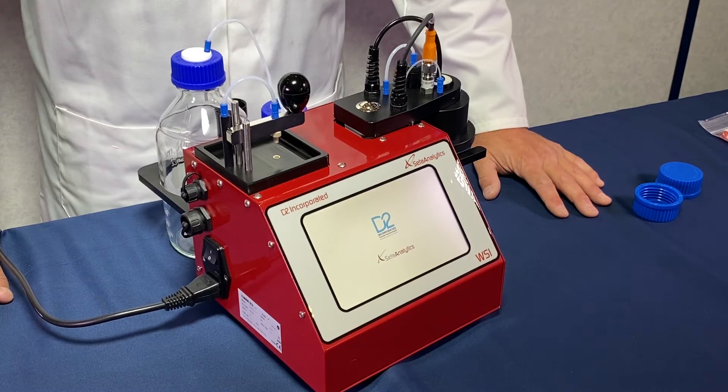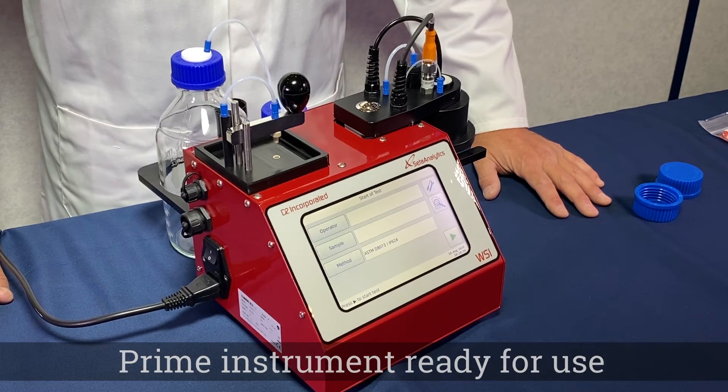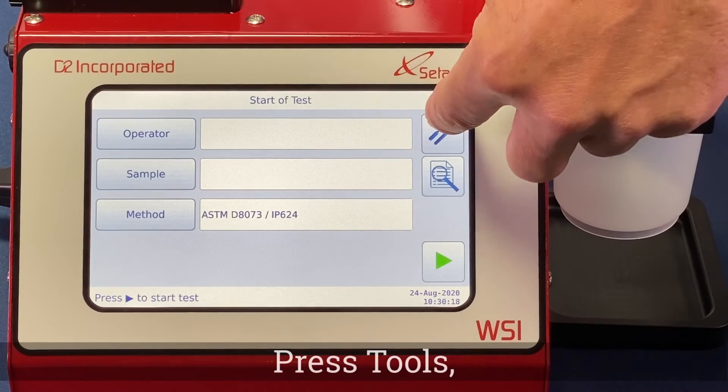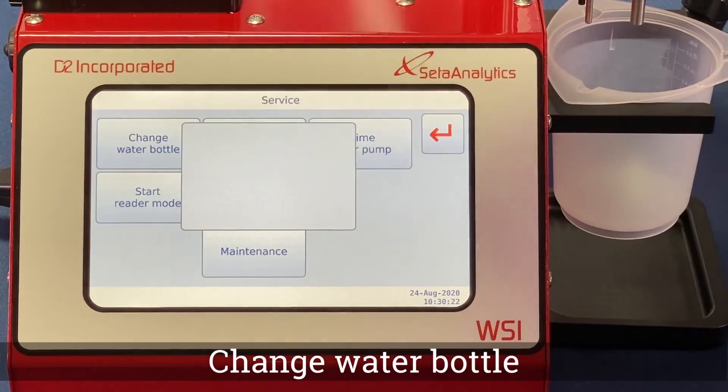When being used for the first time, or when replacing a dyed water bottle, the WSI needs to be primed. Start by placing an empty beaker in the sample holder. On the start screen press the Tools button, then the Service button, and finally Change Water Bottle.